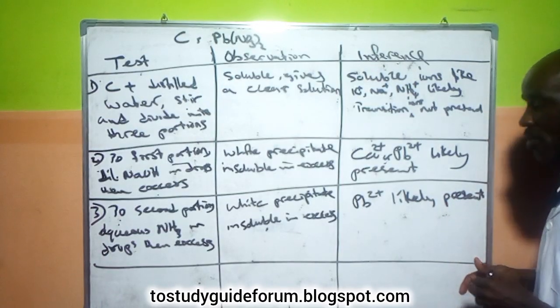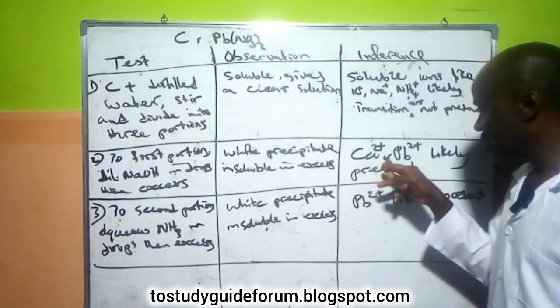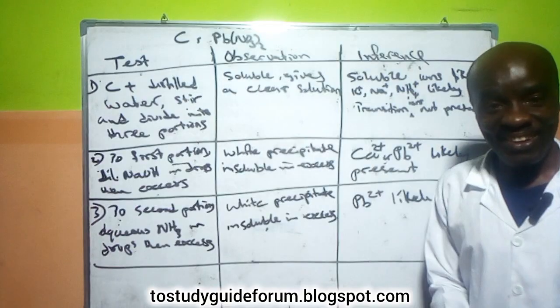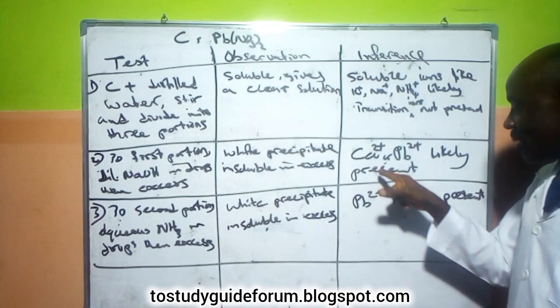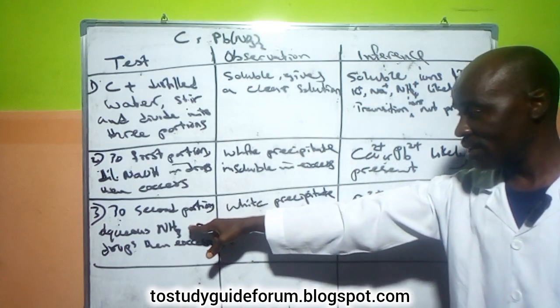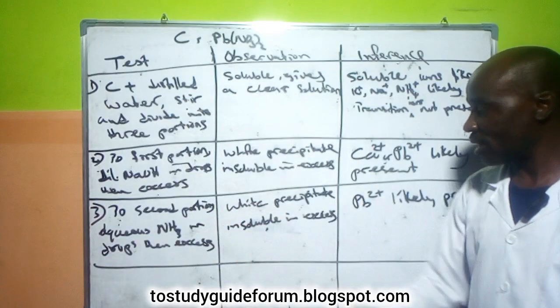Now this is more like an elimination method. Why are we going down to lead? Because this other one does not show any reaction or precipitate with aqueous ammonia.